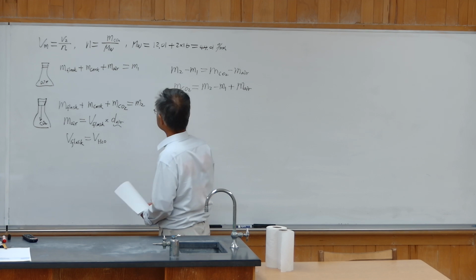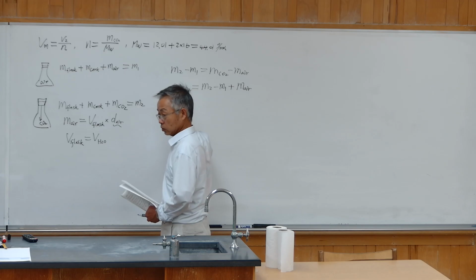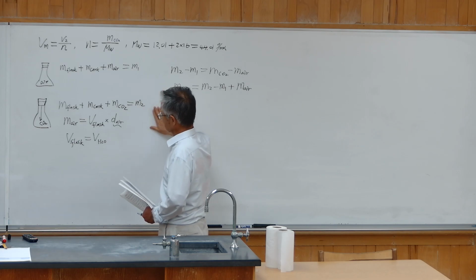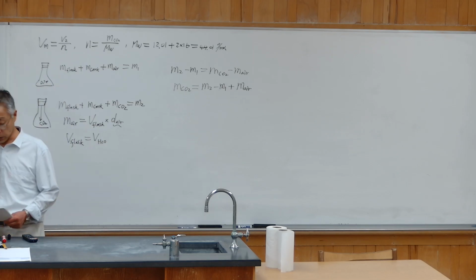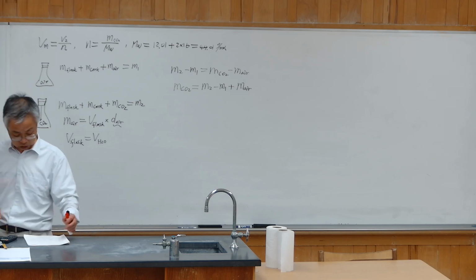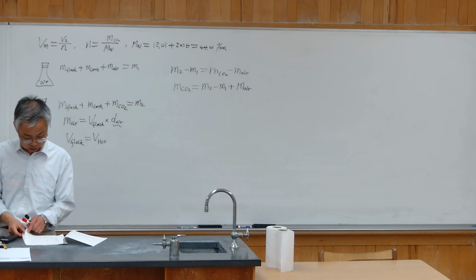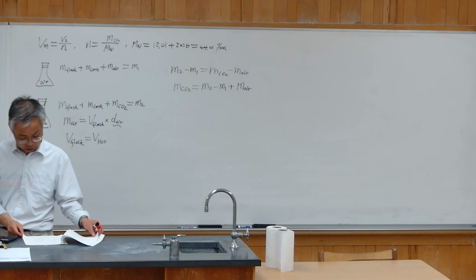So again, how to calculate the mass of carbon dioxide also has a formula listed in the data sheet, in a separate sheet for calculation of lab 8. Anyway, similar to what I explained here. So again, we have a video that shows the experimental procedure. I placed it at the same place of this lab. So watch that procedure video carefully. Then you need to complete a lab report together with pre-lab and post-lab.